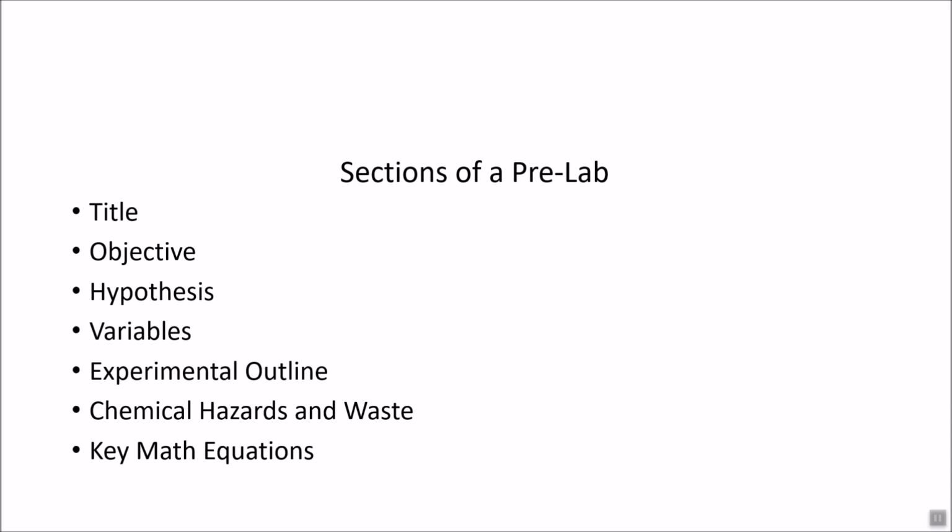So the first thing we're going to do is we're going to make a series of saltwater solutions. We're going to make 5, 4, 3, 2, and 1% saltwater solutions by mass. We're then going to take those saltwater solutions and we're going to measure the conductivity of each. We're going to use those values of concentration and conductivity to generate what's called the calibration curve.